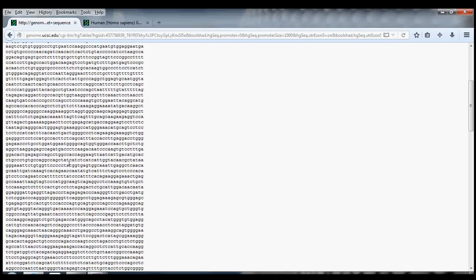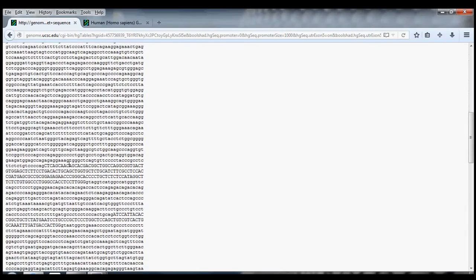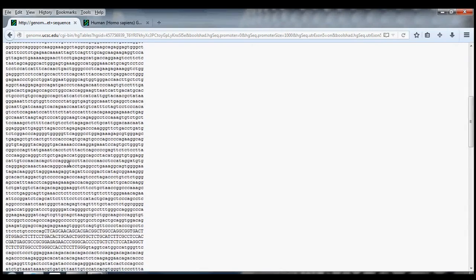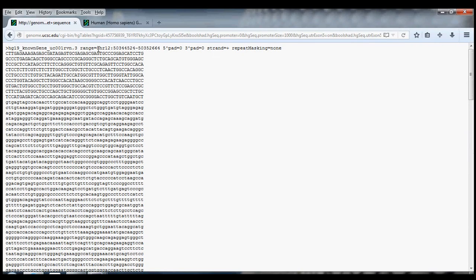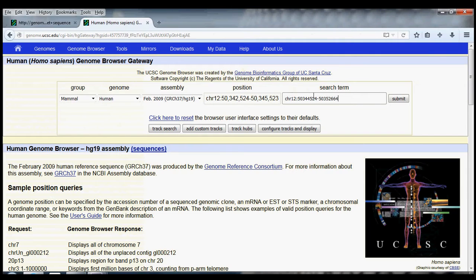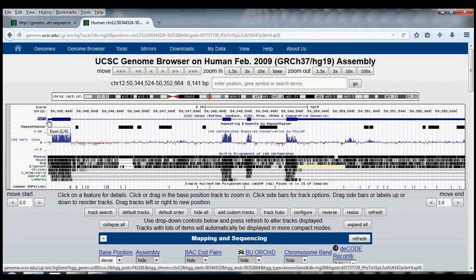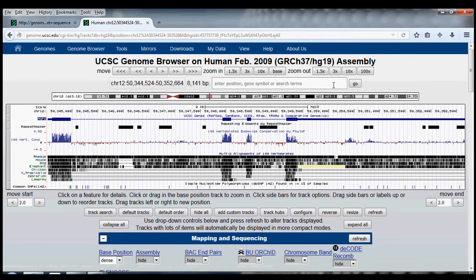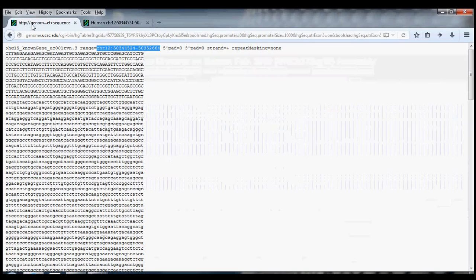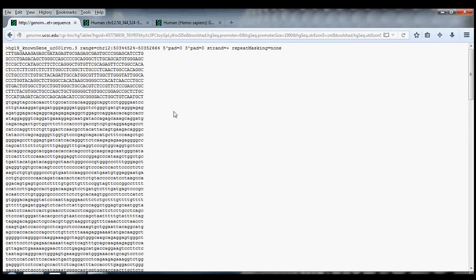And there we go. Here is the sequence of the aquaporin-2 gene with the introns in lowercase and everything else in uppercase. Just to make sure we got this right, let me copy this coordinate from the title of our sequence and paste it back into the genome browser to verify that this was the sequence we were looking for. Our region did define the aquaporin-2 sequence from 5' to 3'.